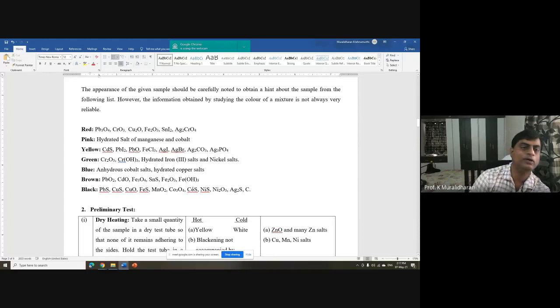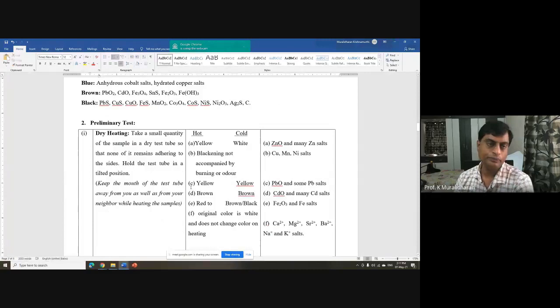Okay. So the first thing you will be doing is dry heating of the sample, taking a little bit of the sample and putting it into a test tube, right?